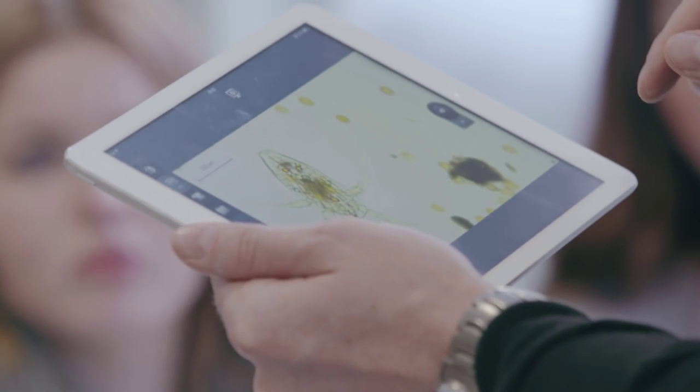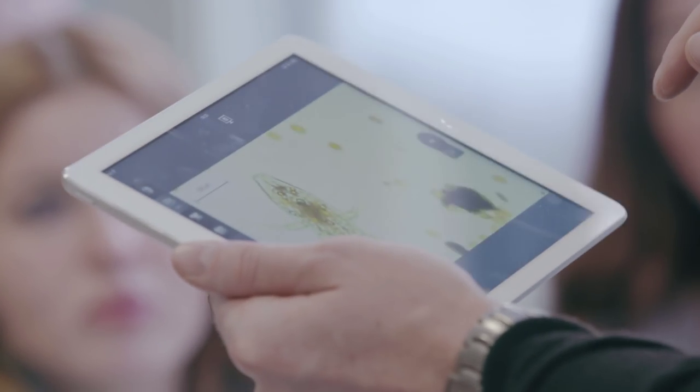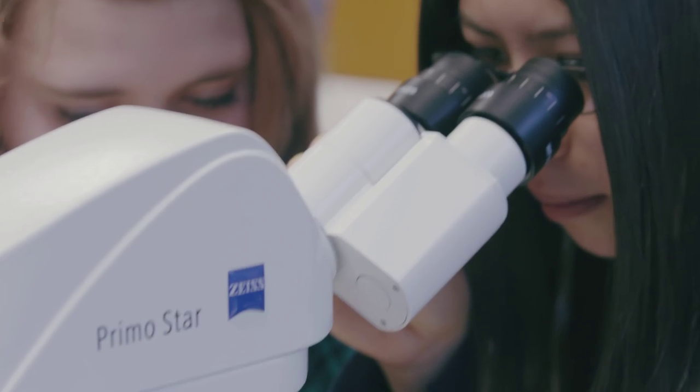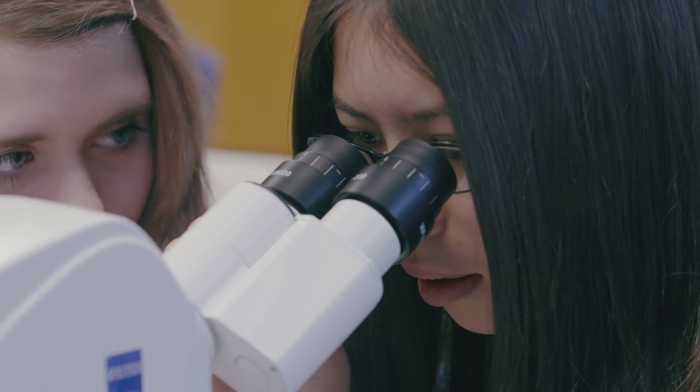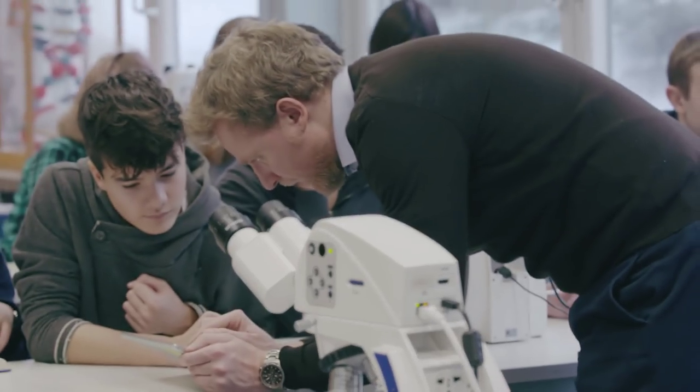On the other hand, I can constantly see on my tablet what the students are seeing with their microscopes. This allows me to better help them.